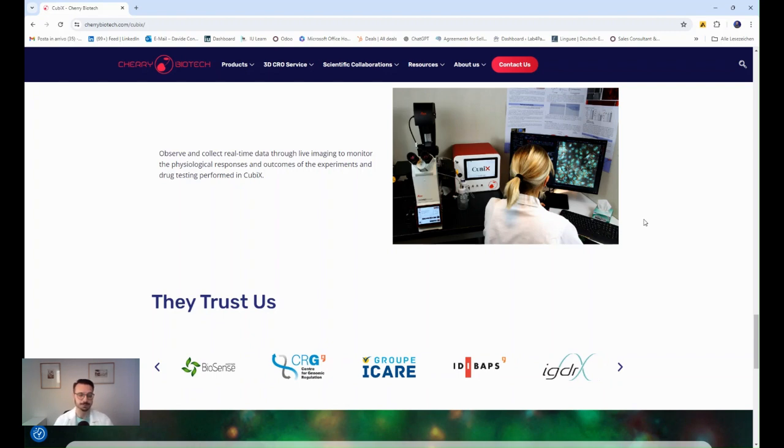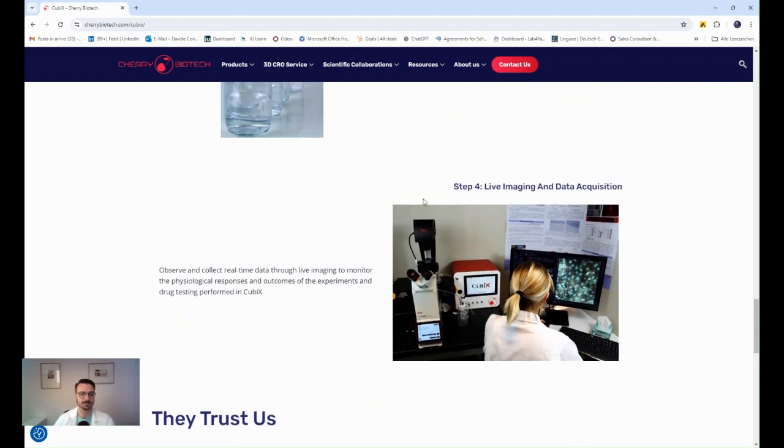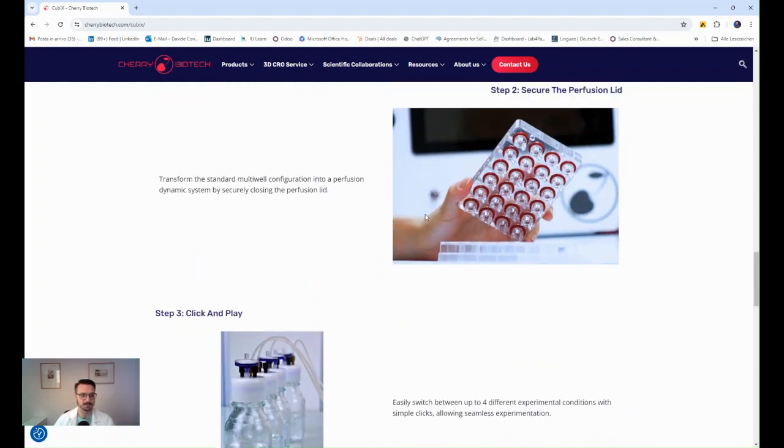We didn't have really the experience of dealing with those devices, and we do not know 100% how easy it is to set up the device itself. From the design, you can see that there are these rubber O-rings to basically seal the devices. So we know that depending on the application, they could be sensitive. So here you probably need to pay some attention.